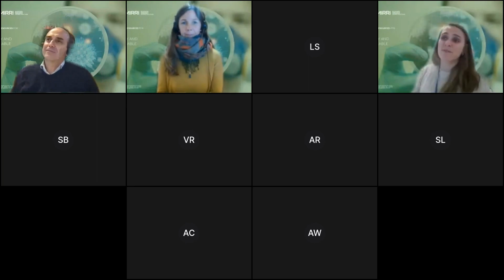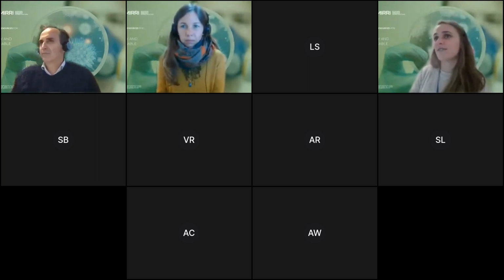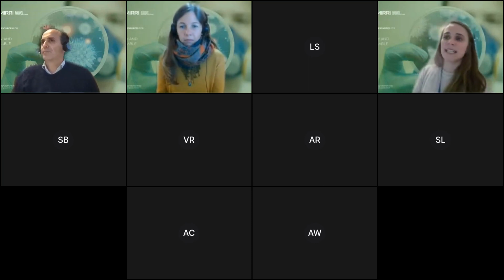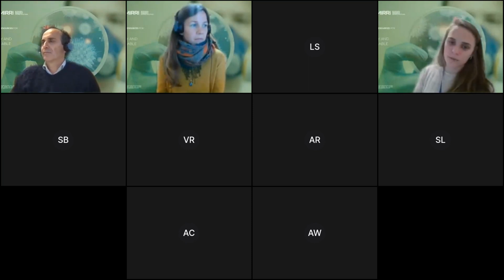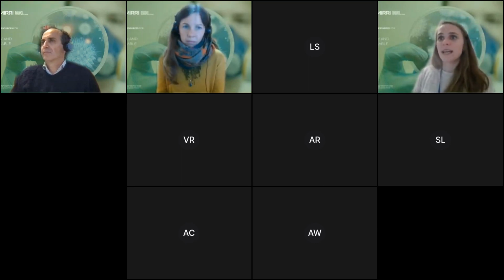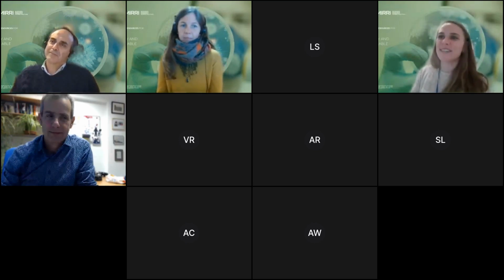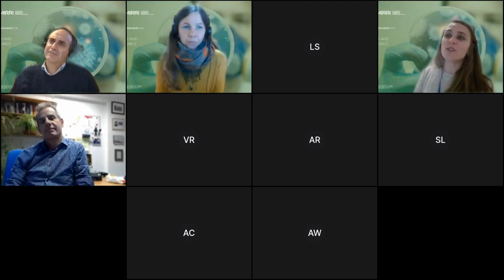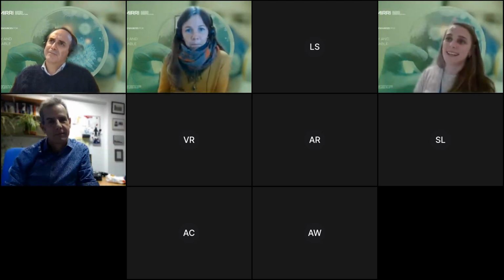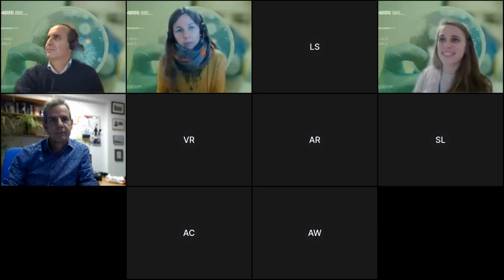What I can say for bacteria is that we may have this kind of situation where multiple alleles are assigned to a single locus. There are different ways to tackle this problem, sometimes using the consensus between multiple alleles within a large data set, or keeping the lowest assigned identifier, for example. I don't know if Sylvain wants to add something about that.